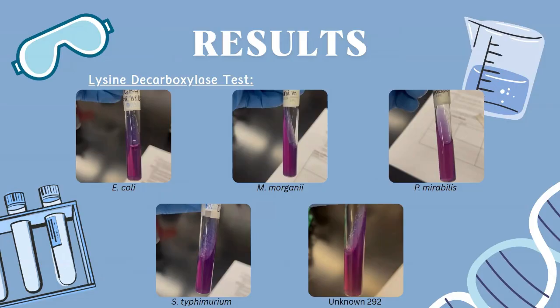The procedure involves using a needle to stab the butt and streak the slant. The butt tests for the lysine decarboxylation under anaerobic conditions, and the slant may show lysine deamination under aerobic conditions. The dual inoculation allows the detection of both pathways.